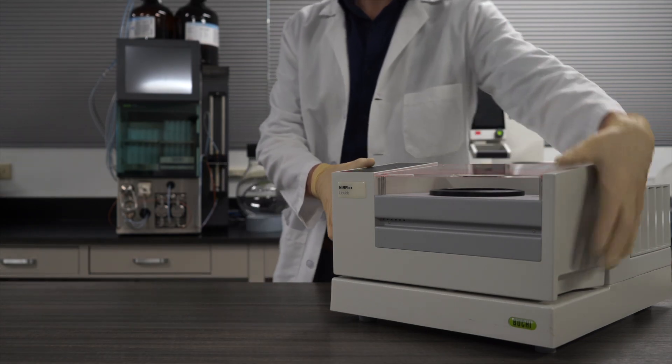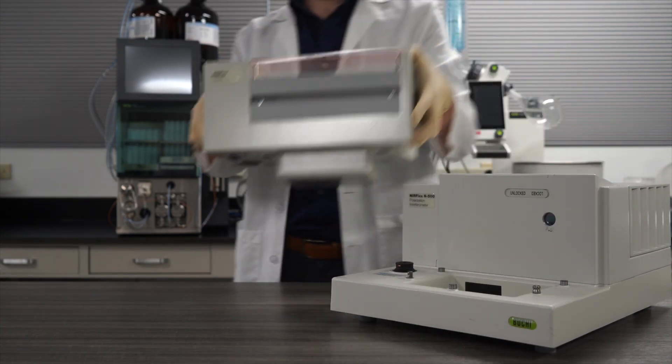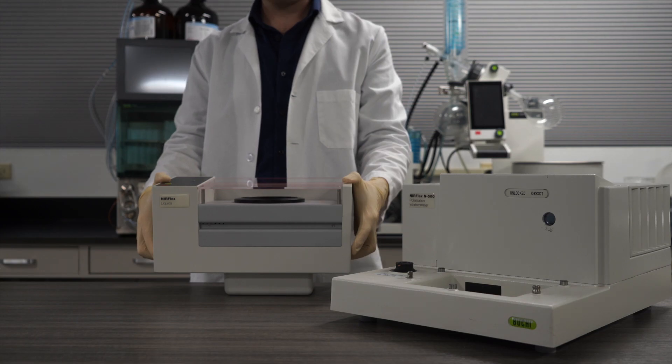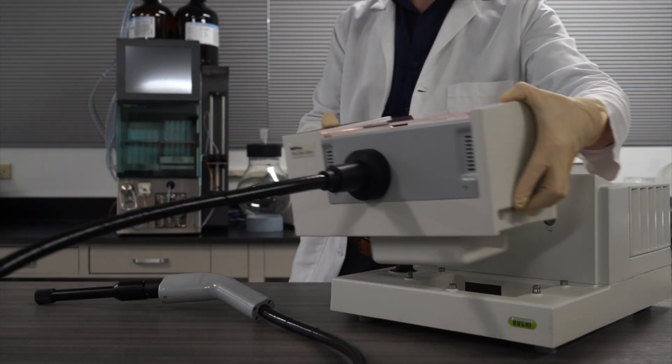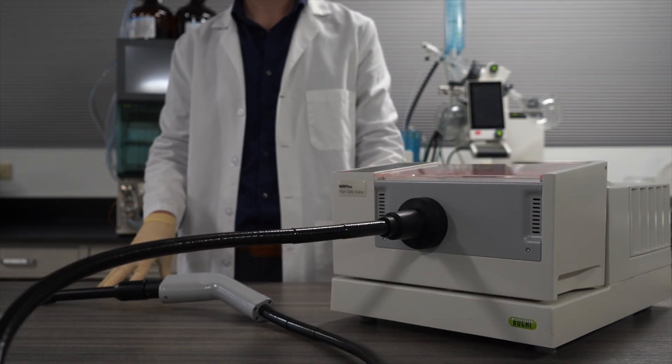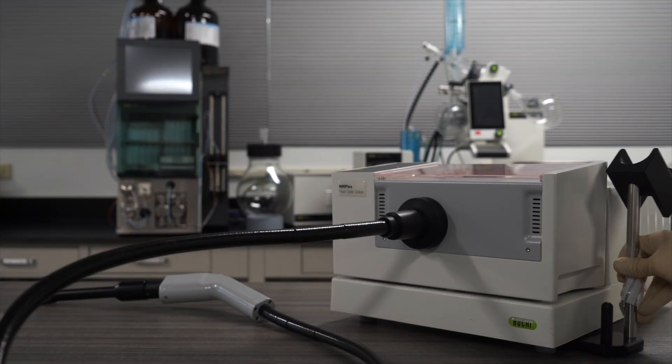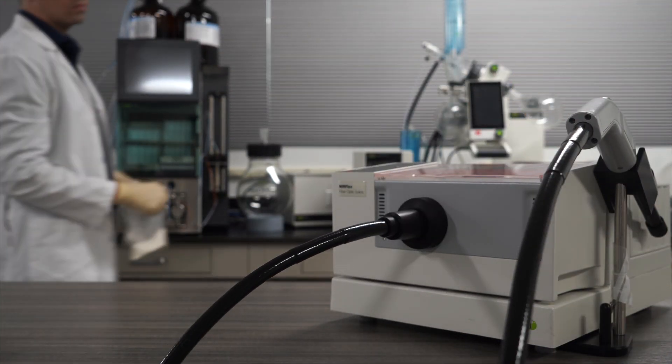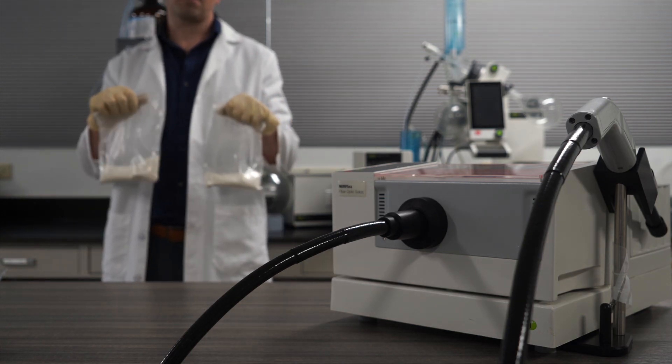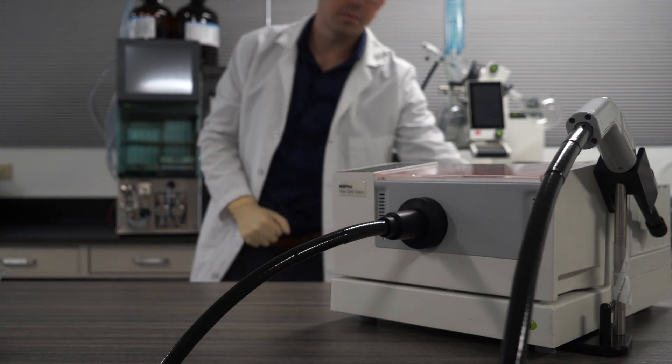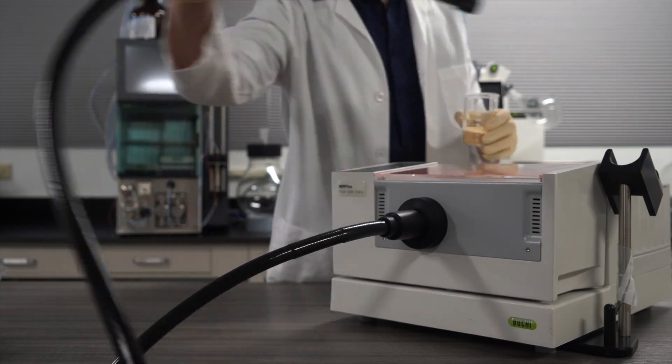If the thought of sample preparation is too much to bear, the N500 also has fiber optic solids and liquids modules for analysis. This means you can measure directly in drums or bags. If going from bag to bag makes you squeamish, sample with a cup first and measure into the cup instead.